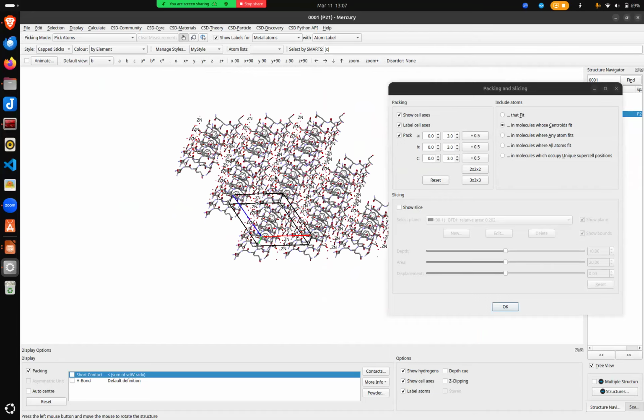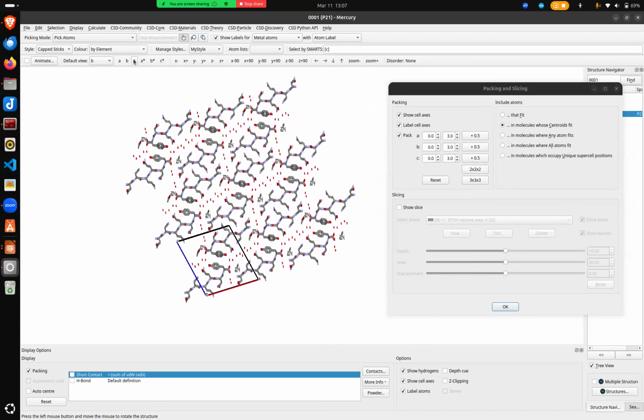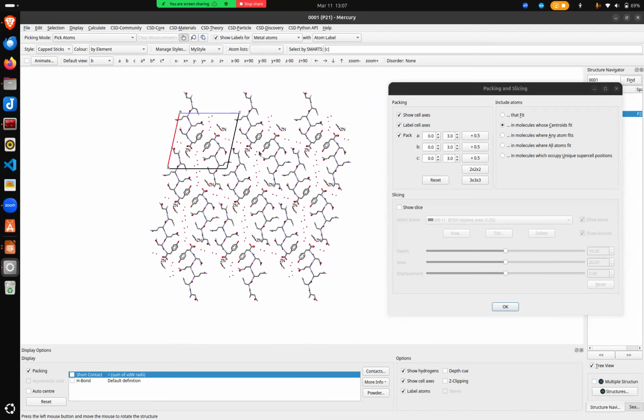And you can see the crystal here. If you look at it along the B-axis, you can see very well those wet and dry interfaces. Basically this is the same image that they had in the publication before.